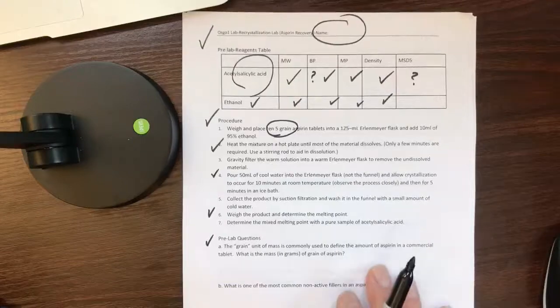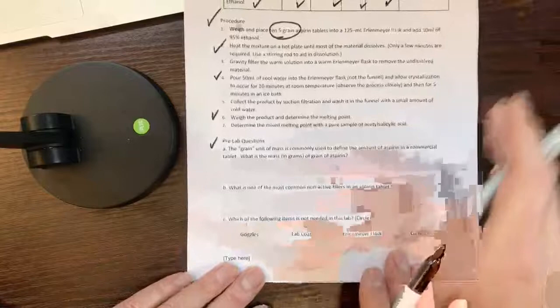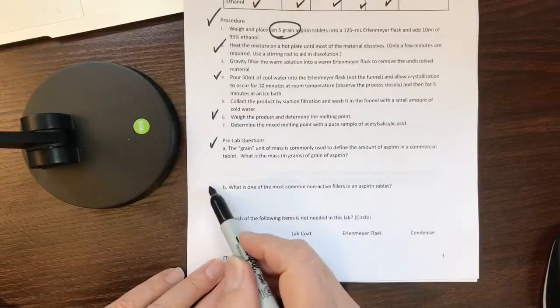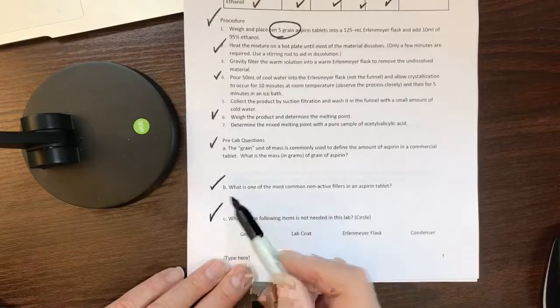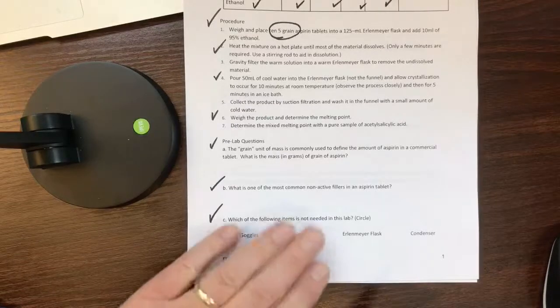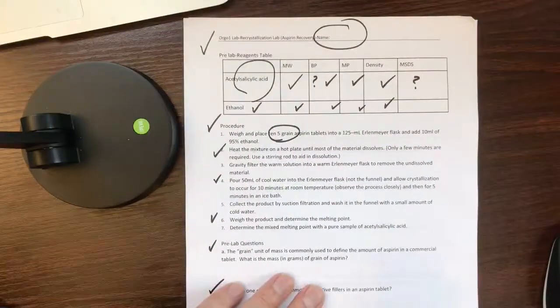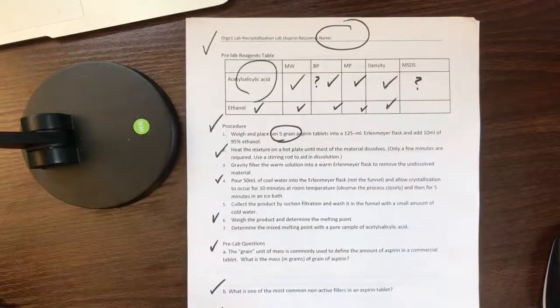Then we have pre-lab questions. So put this paper a little bit higher. We have pre-lab questions, very simple ones. What is the grain? Common non-active fillers in the aspirin. And what did we not use? So these are straightforward questions. Again, as I said before, we don't need to bring anything to the lab tomorrow. We put it all together and bring it 2 weeks from now. Okay.